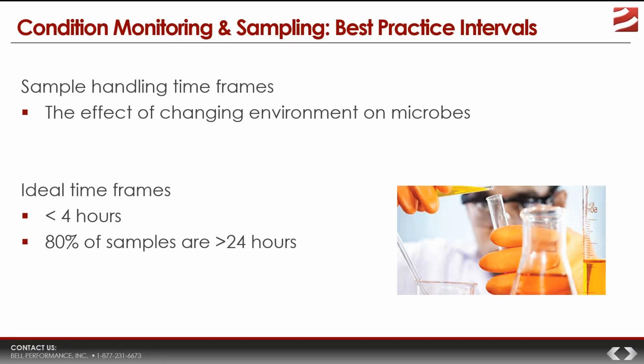That's a false positive. It's not ideal, but the silver lining is that we're going to be able to see qualitatively that there is microbial presence in there. That's one thing you can say for sure. You may not be able to say, yeah, we got 10,000 microbes, but you can say for sure, yes, we have microbes in there, enough microbes to be meaningful.